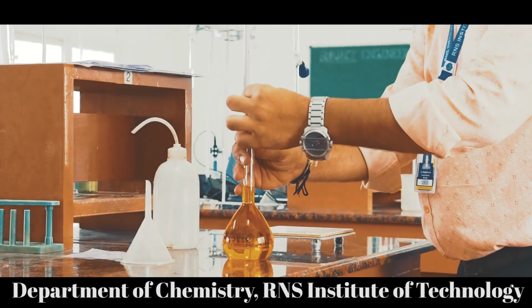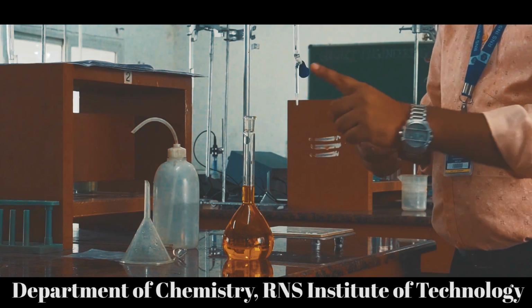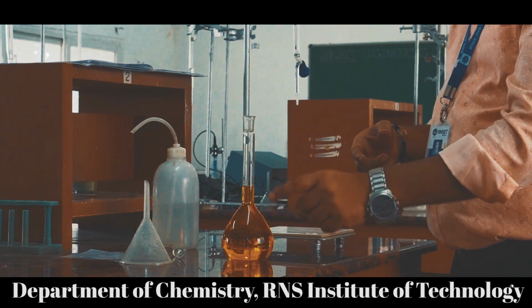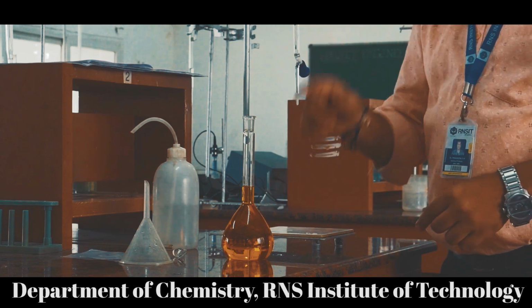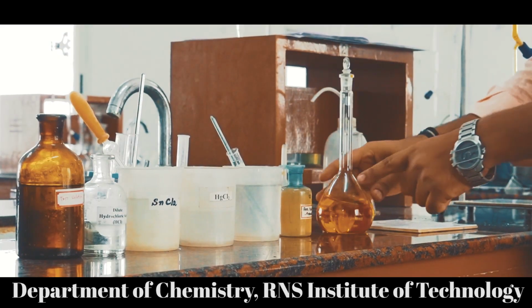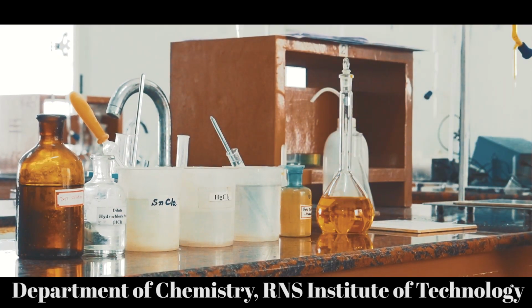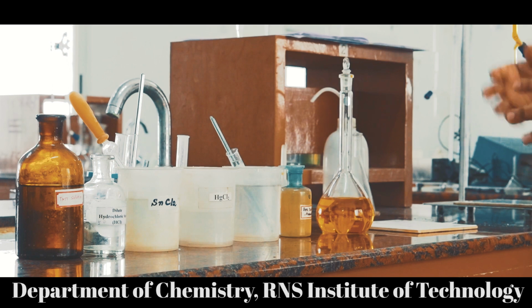Now remove the lid and discard the water taken in the burette, and fill the standard solution, that is K2Cr2O7, into the burette. Before filling, you have to rinse the burette with standard K2Cr2O7 solution. Now I have prepared the standard K2Cr2O7 solution and filled it in the burette. So this completes the first step. Now let us move towards the second step, that is the titration step.